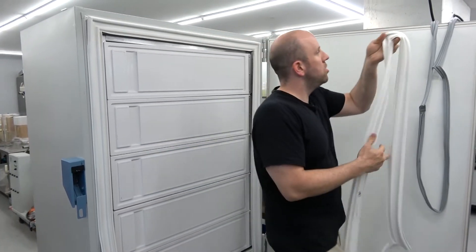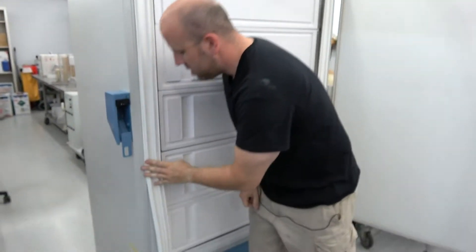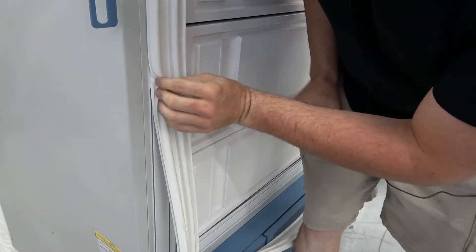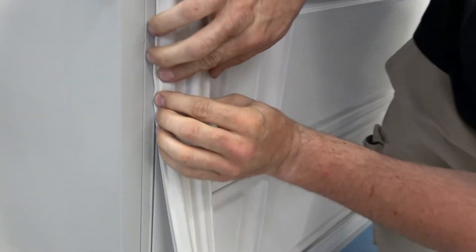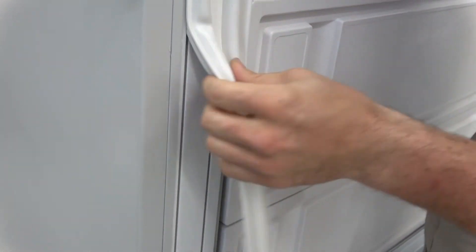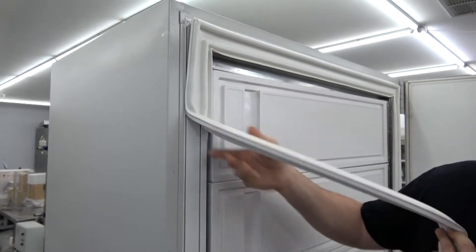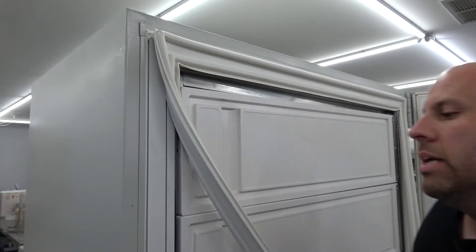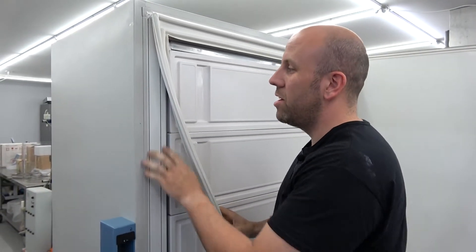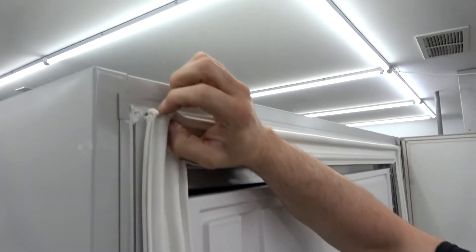I'll give you a quick idea of how simple it is. This is the new seal I'm putting on, but this is literally how you take off the old seal — it just fits into this track here. You just press it in when you're installing it, but to take it out, you just pry in here, get it starting to come out, and then you literally just pull it out. It's crazy easy to remove.